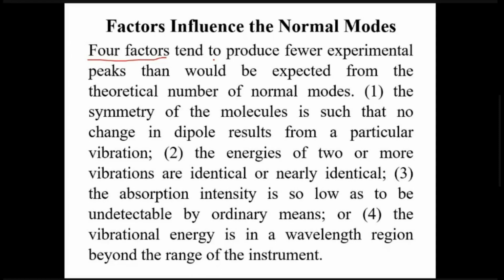You consider the charge on atoms, the strength of bonds, the distance between the atoms, and theoretically predict the ways in which the molecule will vibrate. But the actual peaks that you observe in the IR spectra differ from what you theoretically calculate. There is a reason underlying it. Let us go through those factors.